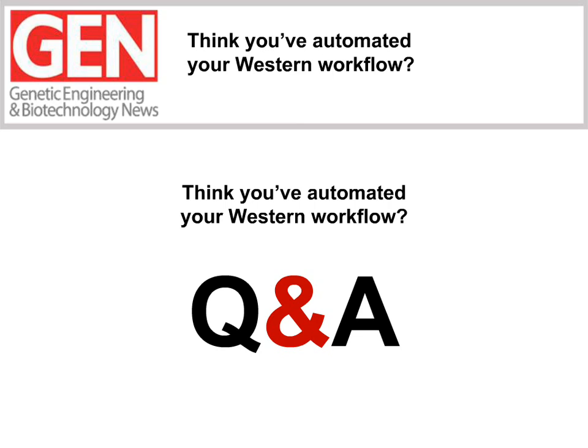All right, Catherine, now I have some questions for you. Is your software amenable to 21 CFR Part 11? Yes, it is, and we're trying very hard to ensure that it is. So 21 CFR Part 11 is FDA regulations about keeping data secure and making sure things are version tracked, making sure that nobody can tamper with the data. So all of our code is actually tracked in Git, so we can go back in time to previous versions and look at changes that we've made in the past.